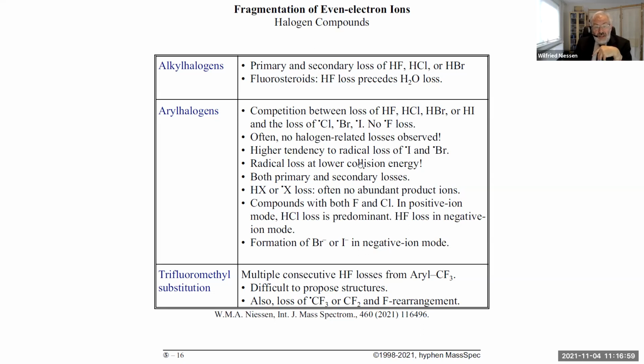Interestingly enough, the radical losses occur at lower collision energy, while you would expect that since this is a homolytic cleavage, it would go at higher collision energy.